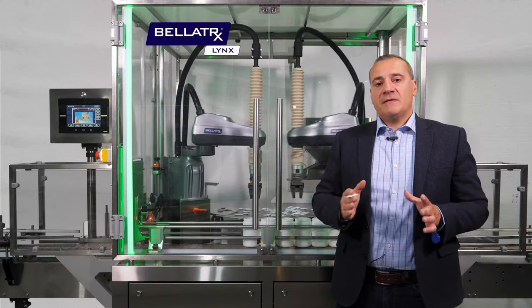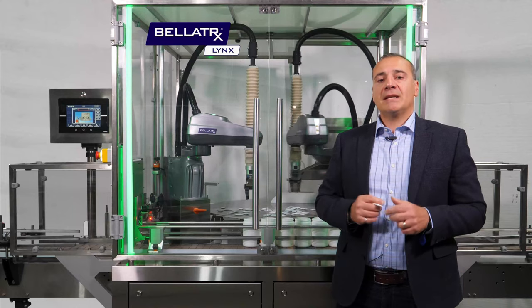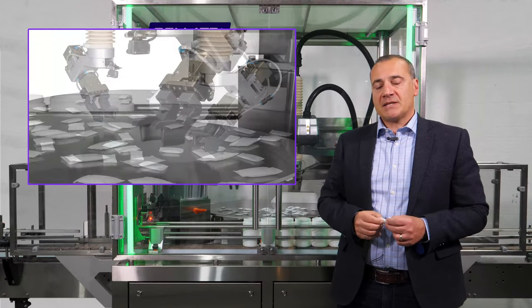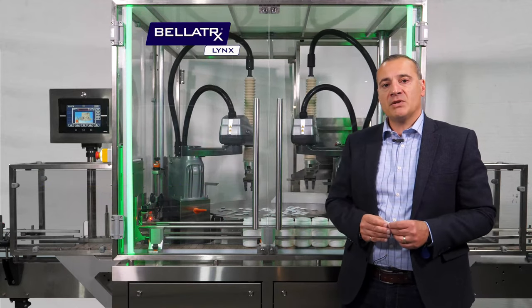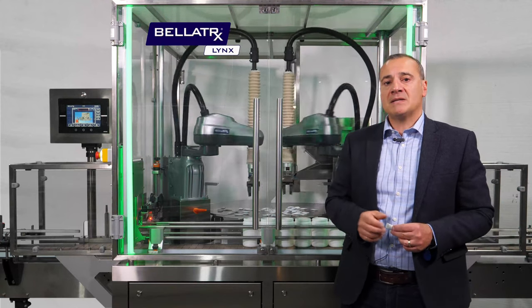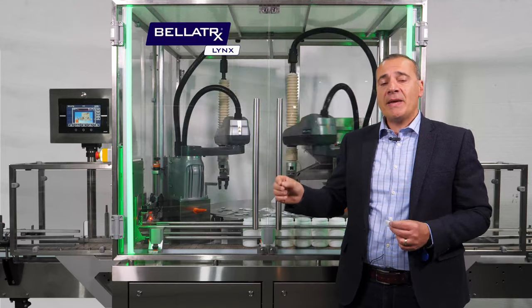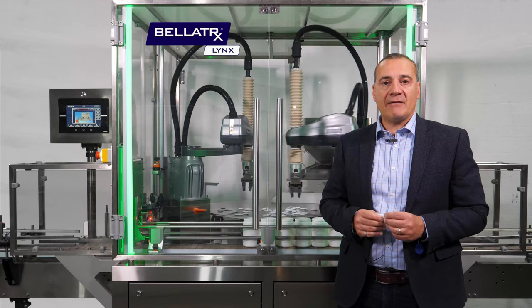Once the desiccants come into the field of view of the robotic pick area, the target desiccants are identified — the ones that can be picked up. We have end-of-arm tooling that is able to reach out and pick up these desiccants. We have a conveyor passing through the machine; the bottles are indexed in front of the machine. In higher speed applications we would put a feed screw here where we can dispense the product directly into the bottle without having to stop it. The robots go to the turntable in the pick area and pick what can be picked from the configuration on the table.